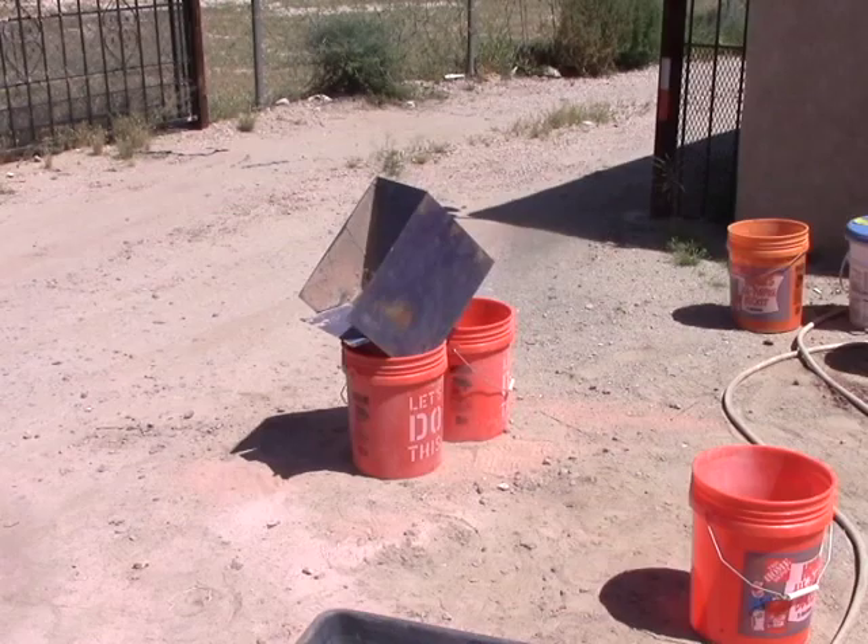Howdy folks, I'm Keith Bowen and this is Hard Rock University. Just a real quick little hit on doing splitting. Now once you've taken a sample, you have to crush it, split it down, and send off a split to the assay lab if you want a good result to be representative.